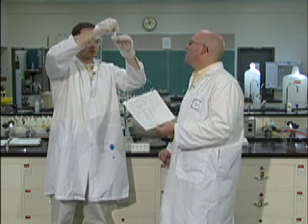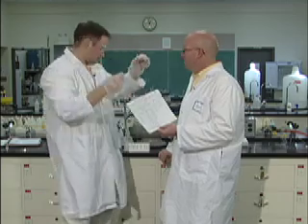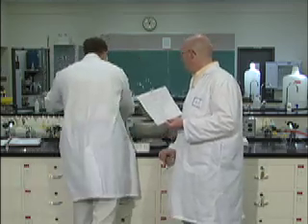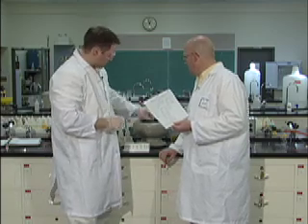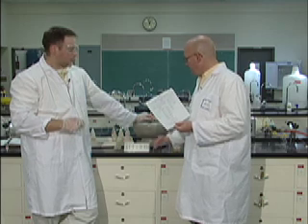Do we get to centrifuge again? We do. As soon as we get a solid formed, right away we know we need to centrifuge. So we stick it in the centrifuge, crank it on for one minute, and don't let it walk away. We still have our balancing tube in there.